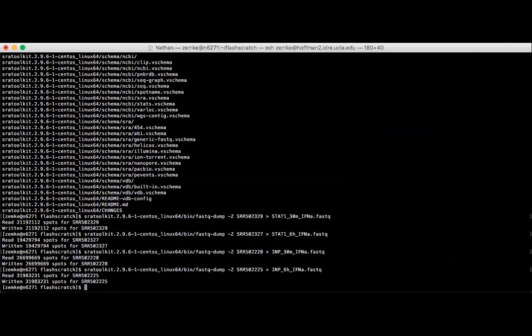So I'm going to start by using the commands on page 42 of the slides. I'm going to download the HG19 reference genome from the Bowtie 2 website.